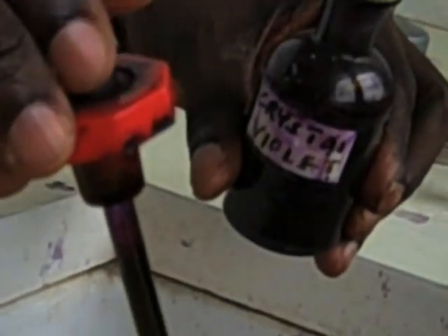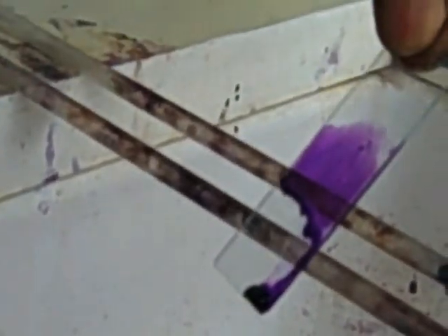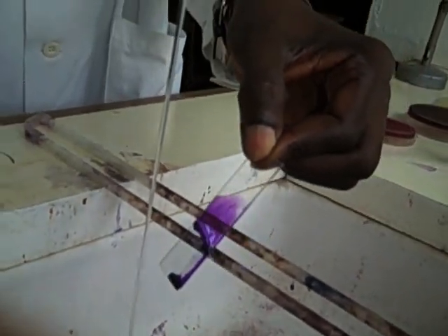Flood the smear with crystal violet for one minute. Then tip off the excess crystal violet stain and wash under gentle tap water.